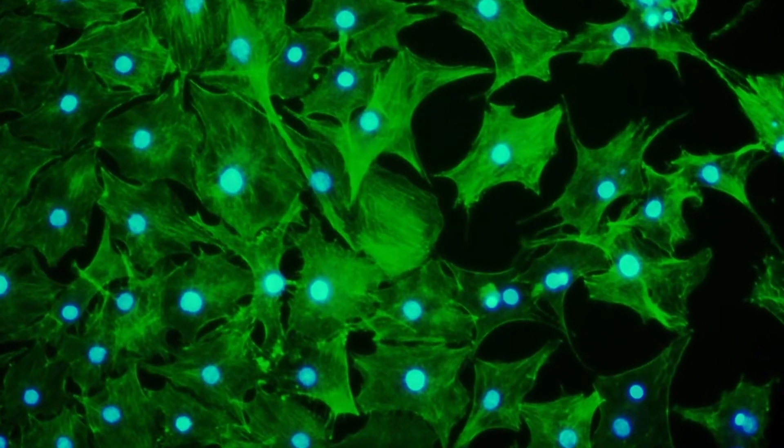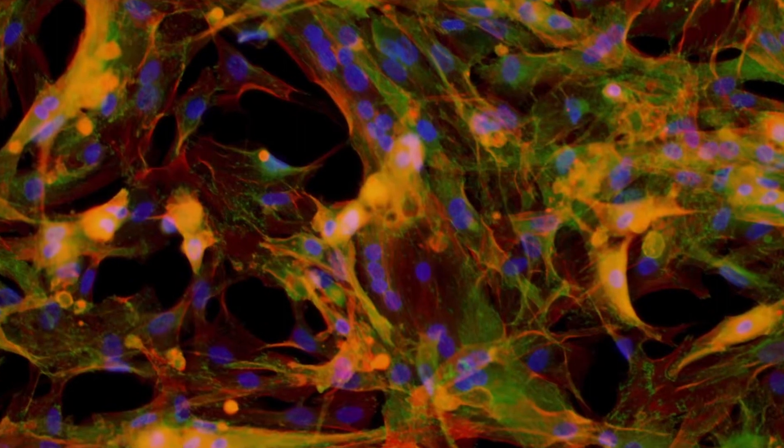The huge advantage of bioprinting is the exact positioning of cells, matrix, and signaling factors. By this, we are able to enhance the complexity of our models to come close to the in vivo situation. In future, we will use this huge potential also for regenerative medicine.